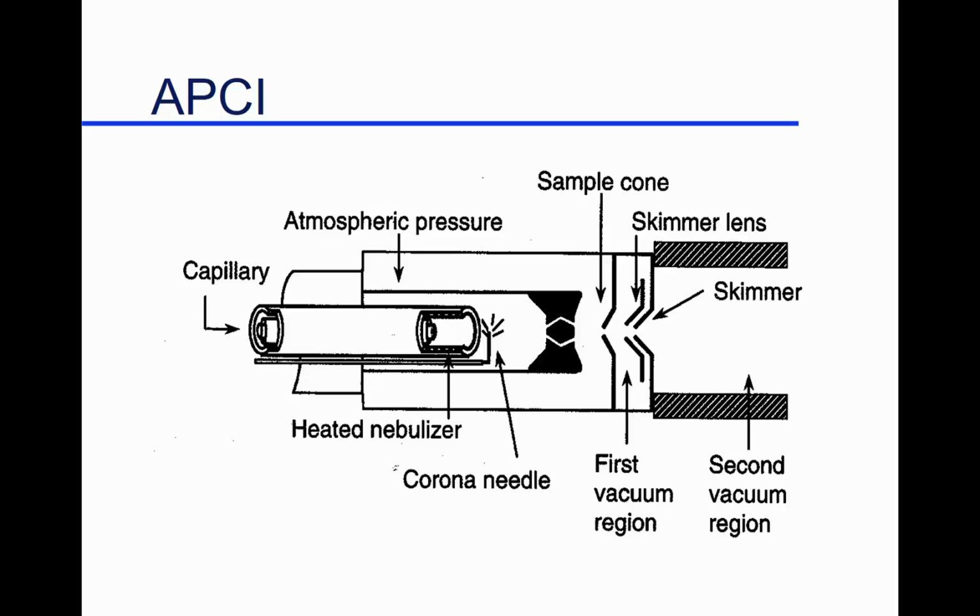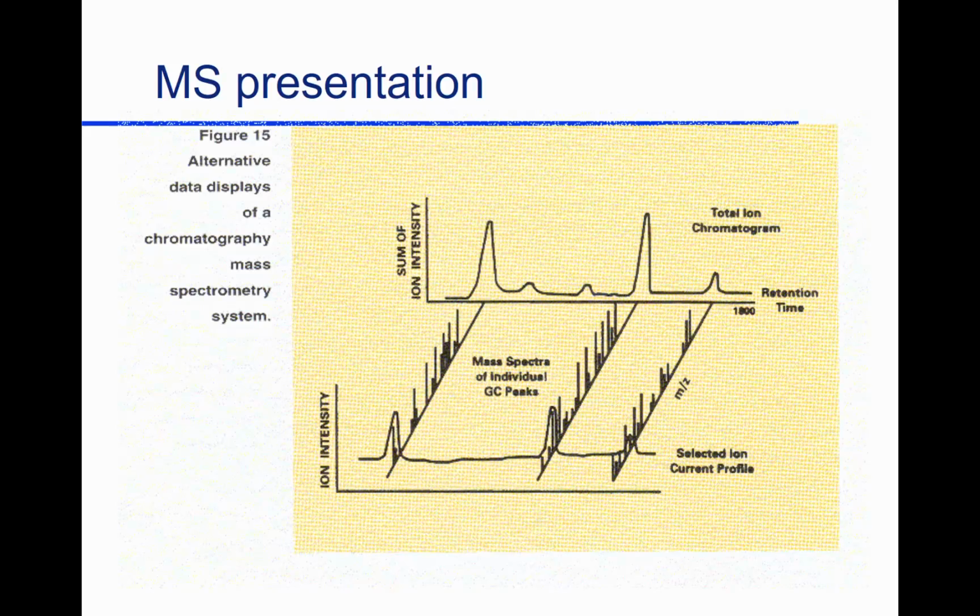This is the atmospheric pressure chemical ionization, APCI, detector. And this is the one we use, so we're sticking this up someone's nose back here, drawing in the breath as you breathe. Instead of having a charged column through here, as you would have with your LC effluent, there's just a nice little needle right here, a needle tip that has about 5,000 volts on it. So whatever air is passing through here goes through a 5,000 volt electric field. And again, that ionizes molecules, and they go then into your mass spectrometer.